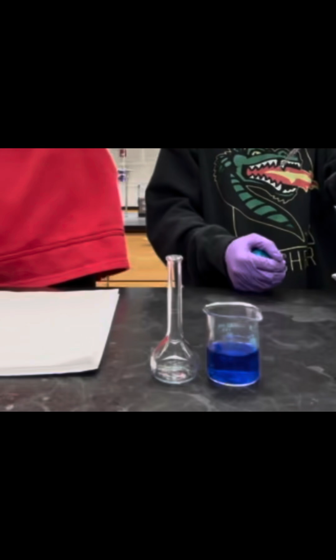A stock solution is prepared by dissolving a small quantity of copper(II) sulfate pentahydrate in a small amount of water in a small beaker. Once all of the salt was dissolved, we slowly added concentrated aqueous ammonia until the solution was a clear, dark blue color. Add an additional 10 drops of ammonia and then fill the flask to the mark with water.